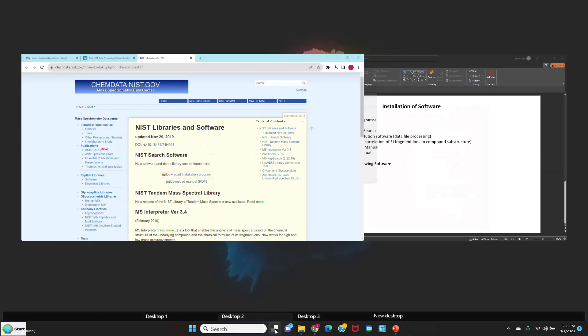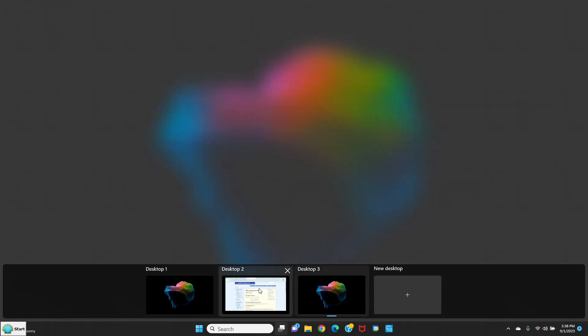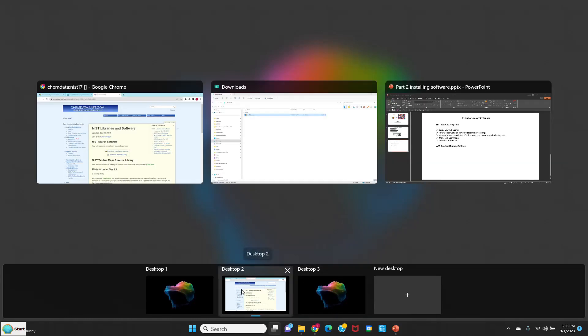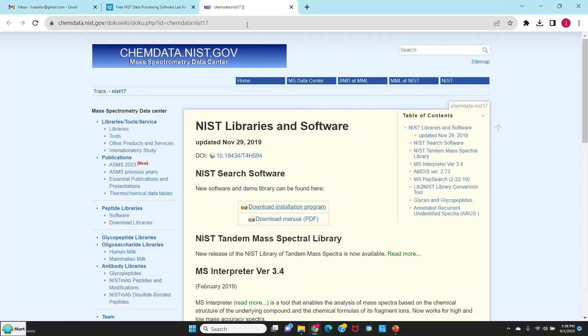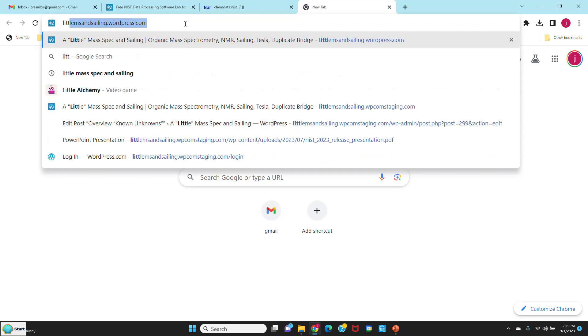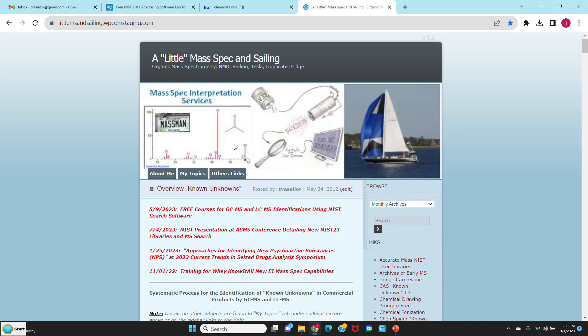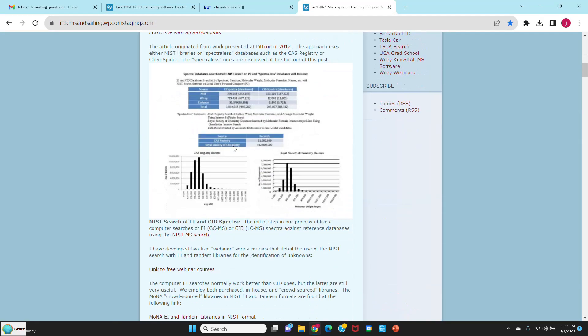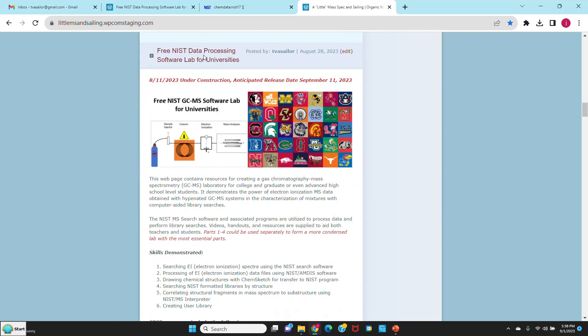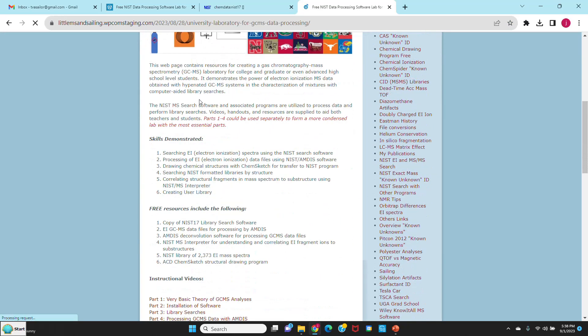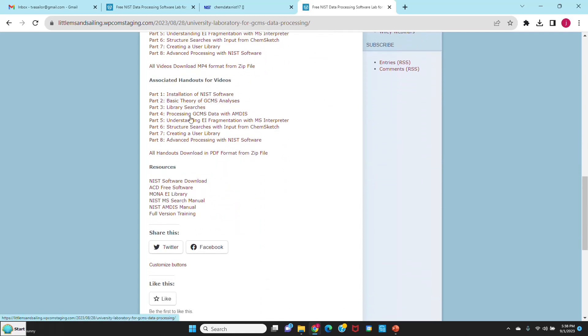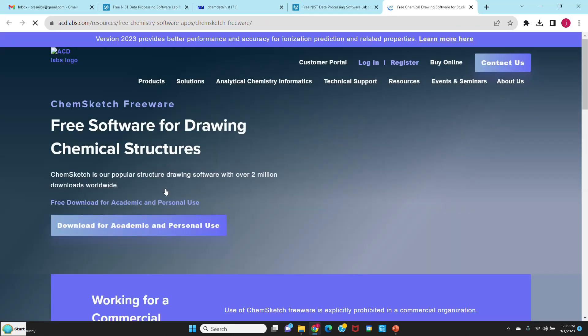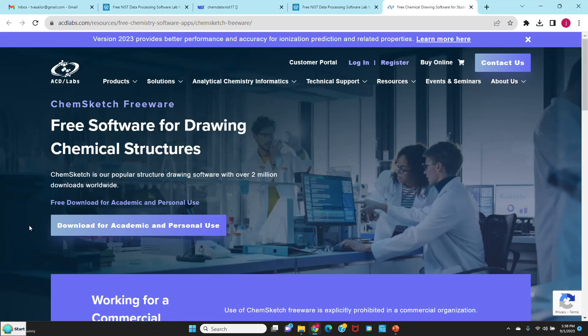We'll go back to my web page. I'll just open my web page again so I can get back to that link. It's the second entry on my page. I'm scrolling down to the bottom again, and you'll see ACD free software. So I'll go to their web page. You see right here it says download for academic and personal use about two-thirds down the page. Just click on that.